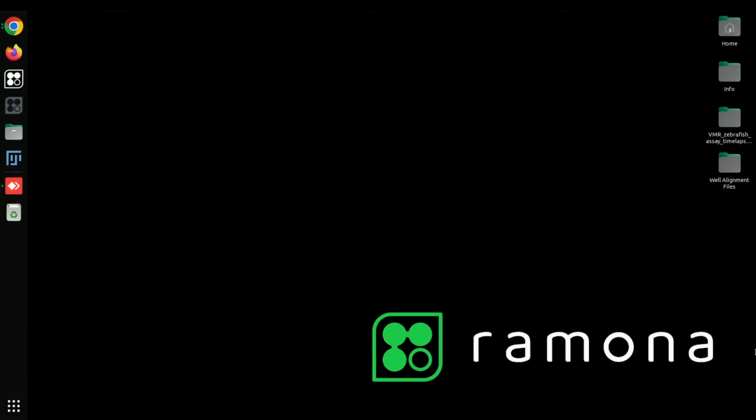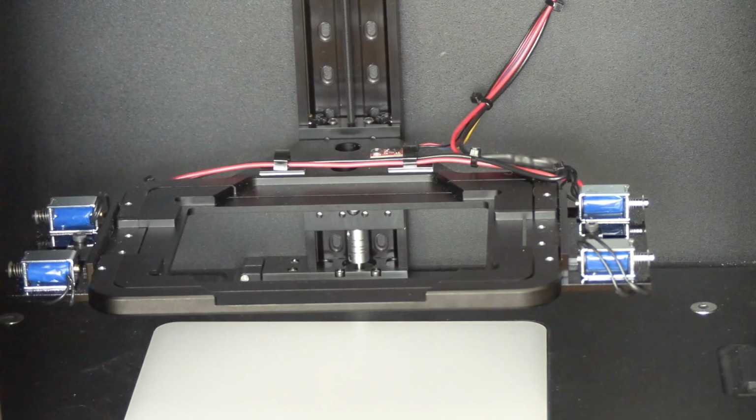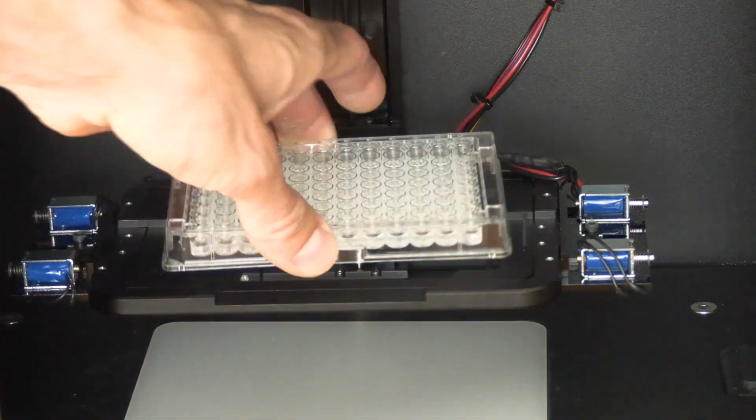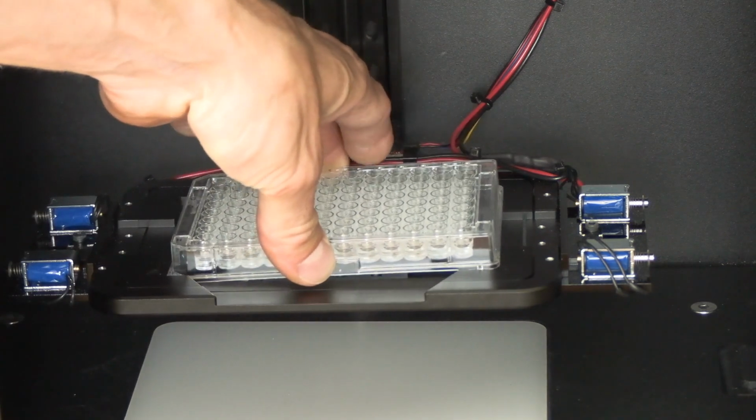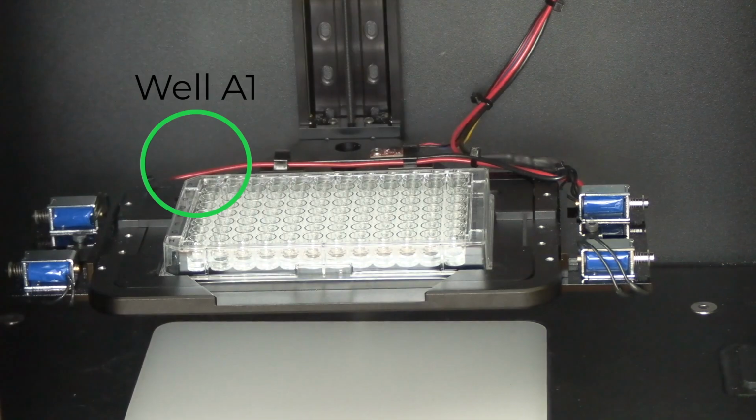In this tutorial we're going to walk through the steps to acquiring a video with the multi-camera array microscope, also known as the MCAM. First, place your 96 well plate with zebrafish into the MCAM. Please make sure the well plate is oriented correctly so that well A1 is in the top left corner.